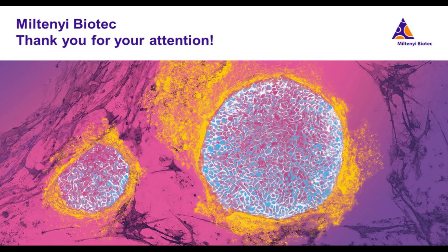So we are using filters, of course, for excitation and then also for emission. So we are separating the signals this way. And the colors you have seen are, of course, artificial colors. We are just detecting grayscale. So we have optimized our filter settings to basically be able to image the entire spectrum, but for now we are starting with 3 fluorochromes, FITC, PE and APC.